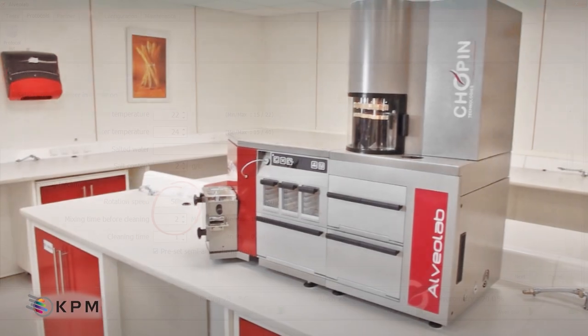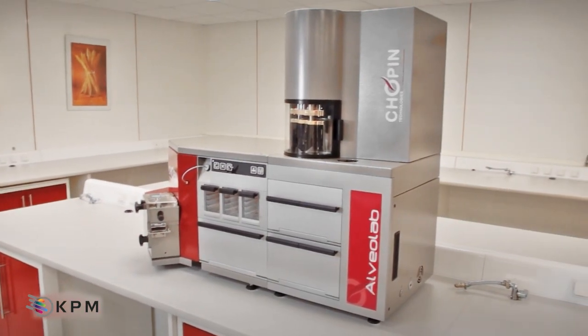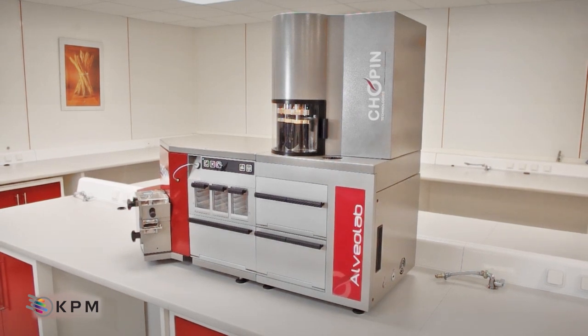Using the Alveolab, it is now possible to increase the number of tests daily, thus optimizing the return on investment.